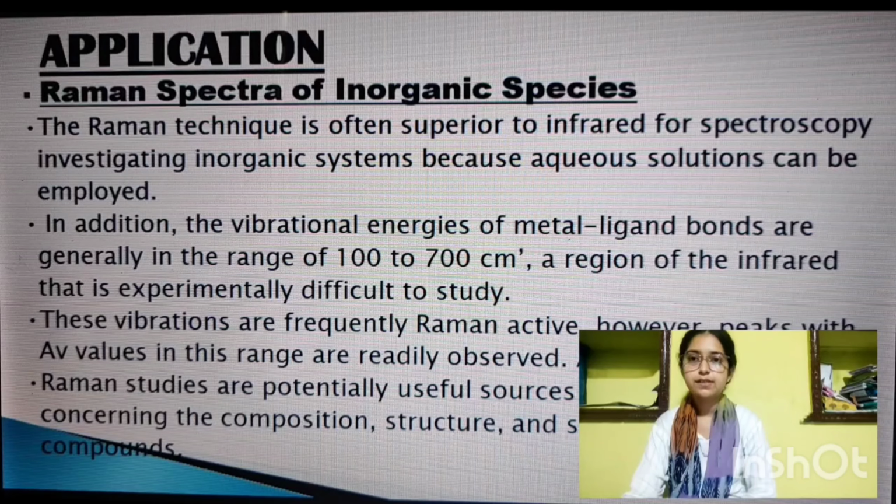Then we discuss the applications. Raman spectra of inorganic species. The Raman technique is often superior to infrared spectroscopy for investigating inorganic systems because aqueous solutions can be employed. In addition, the vibrational energies of the metal bonds are in the range of 100 to 700 inverse centimeters, a region where infrared is experimentally difficult to study.